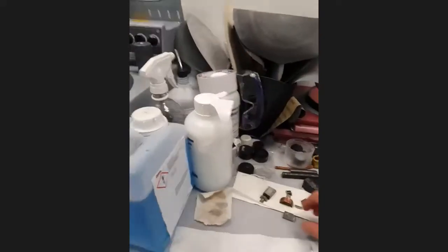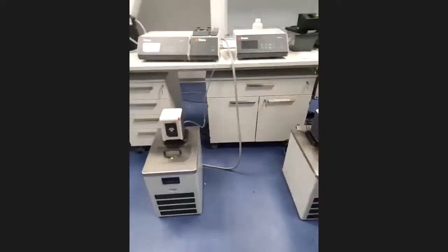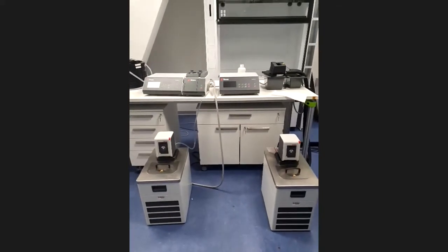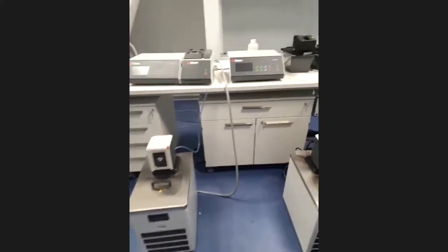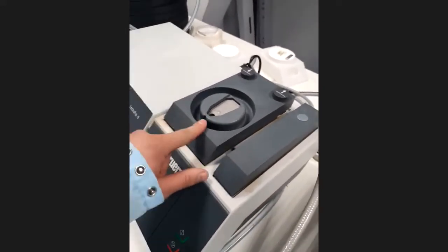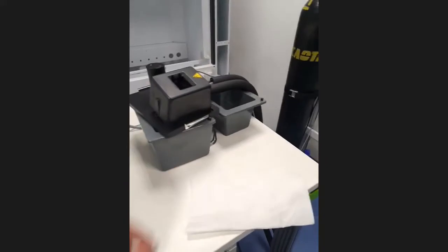And after it, when we have a really nice surface, like a mirror, we should make the structure visible. For it, we use electrolytical cells. This one is for AFM, and this one for transmission microscopy.